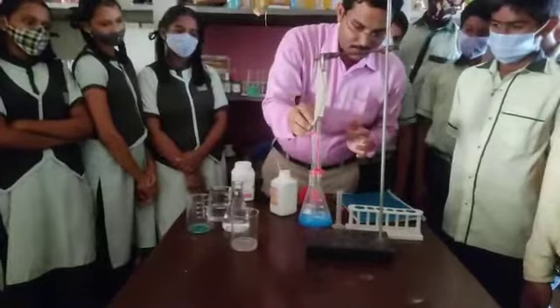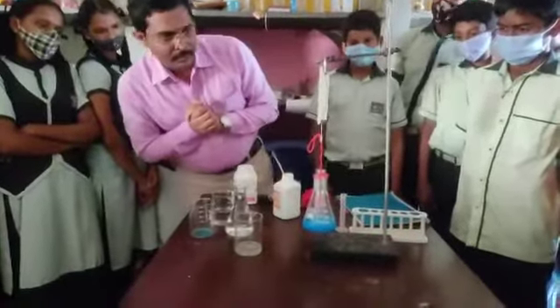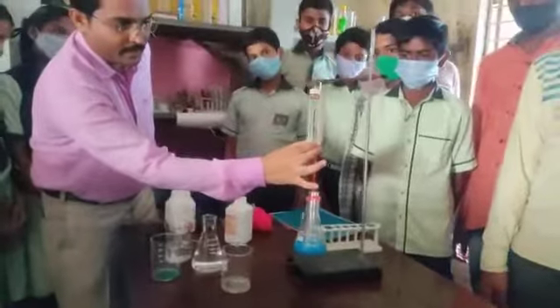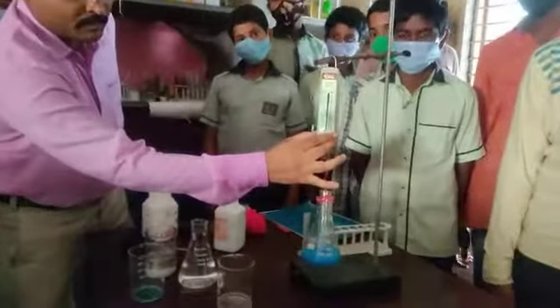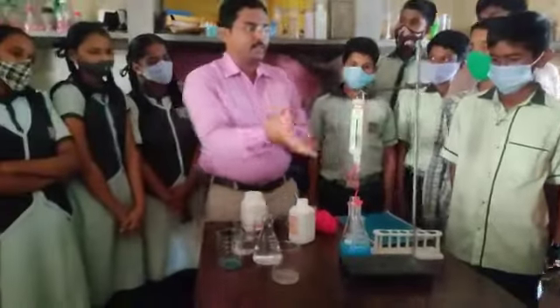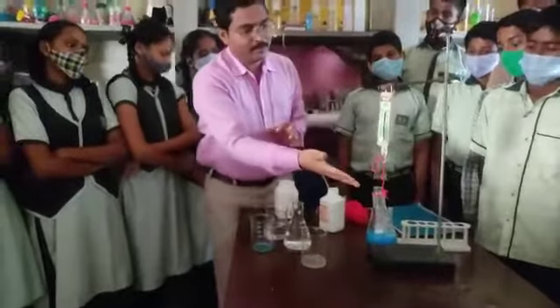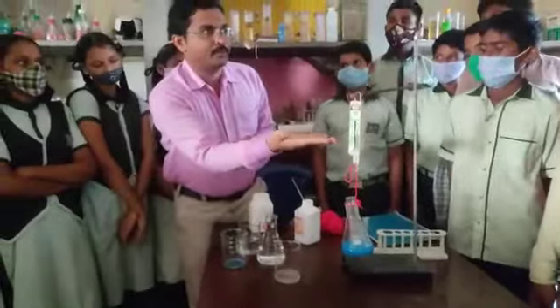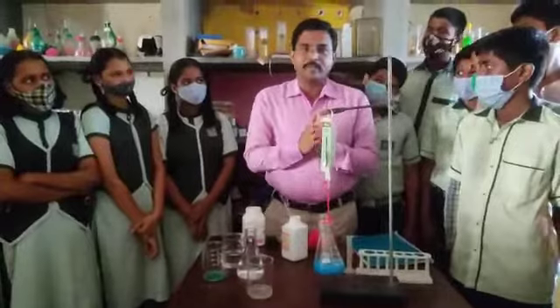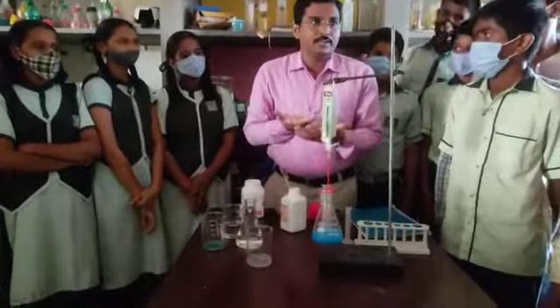Now, keep the test tube back inside the conical flask and observe again. See — the weight is the same. The mass of the apparatus is the same. Before the chemical reaction the total mass was 220 grams, and after the chemical reaction it is also 220 grams. There is no change in mass.